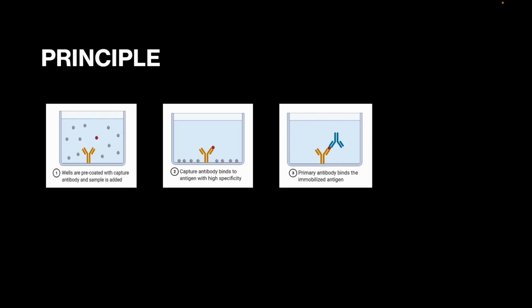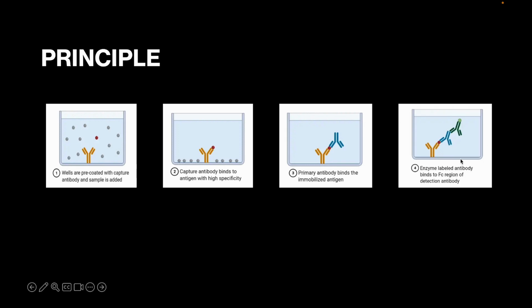And then there are different steps, so there are different types of ELISA. Some use this principle, the same antigen-antibody binding, but with different reactions. In this reaction specifically, we put another antibody which is not very specific. So you see, in the antibody, this region at the top is specific for every antigen. If the antigen is not present, it will not bind here.